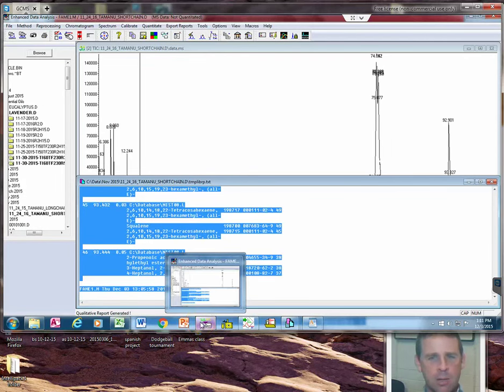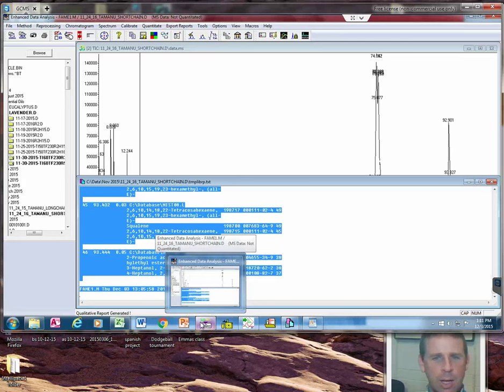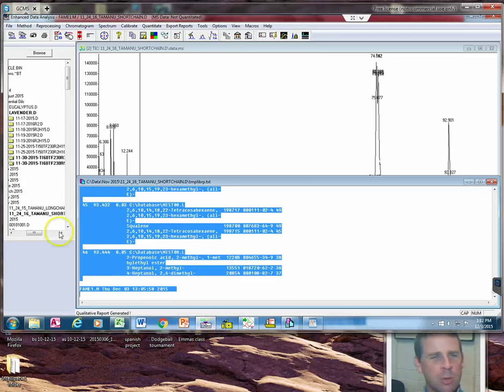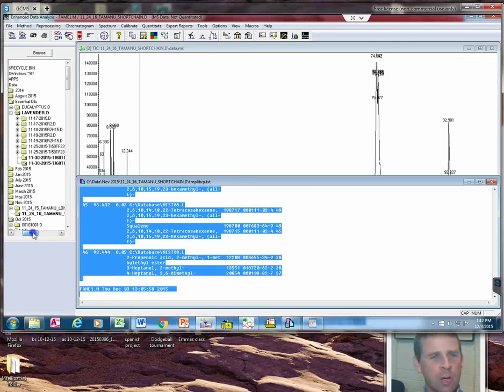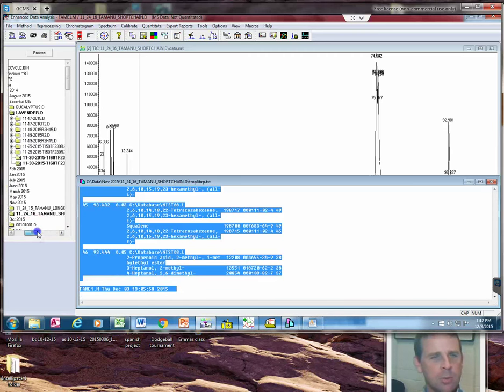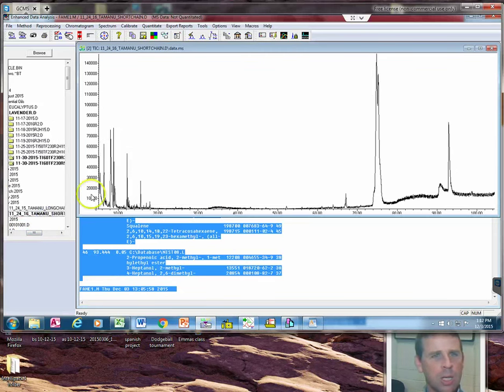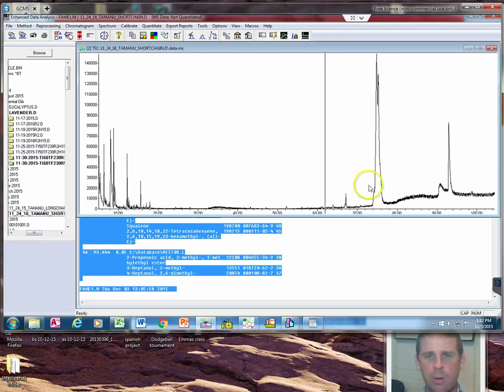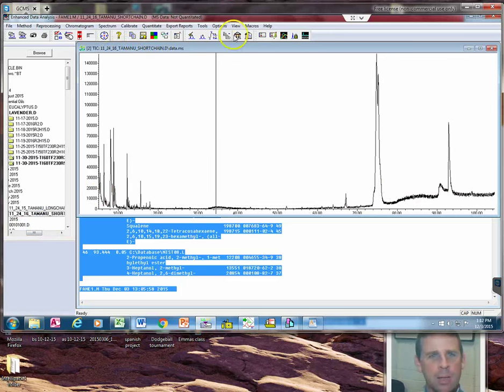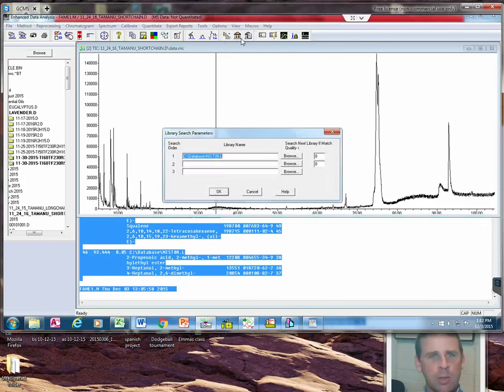We're going to go to our data analysis software. This is the data analysis software, and with the data analysis software here, we're going to identify whatever file we want to analyze. The first one we'll do is this Tomano short chain, so I'll double click on it and it'll bring up the file name here. This is the chromatogram.